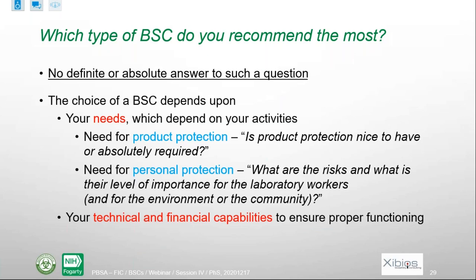फिर सवाल किया था कि कौन सा बायोसेफ्टी कैबिनेट सबसे बेहतर रहेगा. तो उसका जवाब ये है कि ये वेरी करेगा. फॉर एग्जांपल, ये आपकी रिस्क असेसमेंट पर वेरी करेगा, यानी कि आपकी रिस्क असेसमेंट आपको क्या कहती है. आपकी रिस्क असेसमेंट आपको कहती है कि आपको बायोसेफ्टी कैबिनेट खरीदना है. सबसे पहला सवाल, क्या आपके पास वसाइल हैं उसको खरीदने के लिए और उसको फ्यूचर में मेंटेन करने के लिए, आपके काम की नौइयत ऐसी है कि उसकी ज़रूरत है, ठीक है.